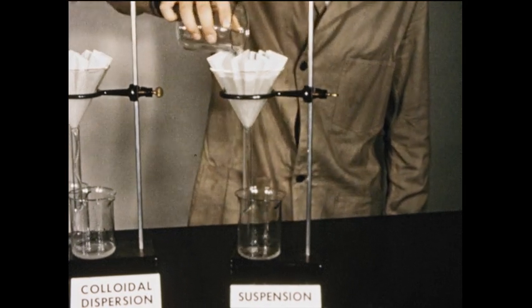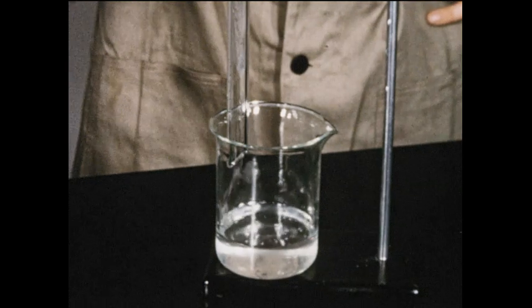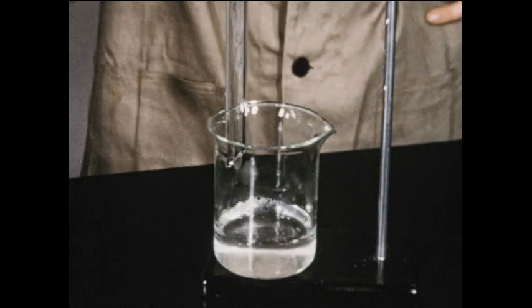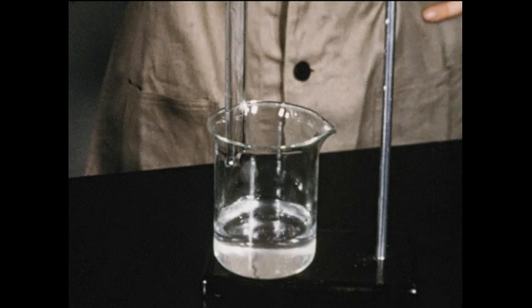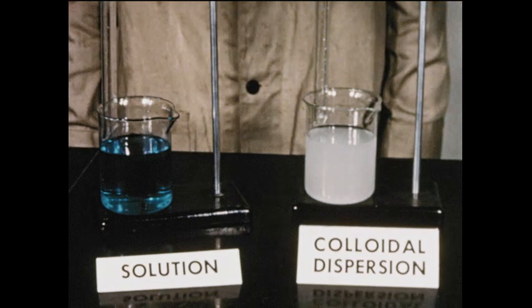But the coarser matter of the suspension, the sand in the water, does not come through the filter. Evidently, the suspension contains the largest particles of our three examples. Both the solution and the colloidal dispersion pass through the filter.